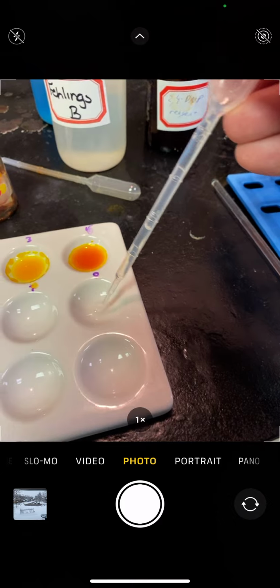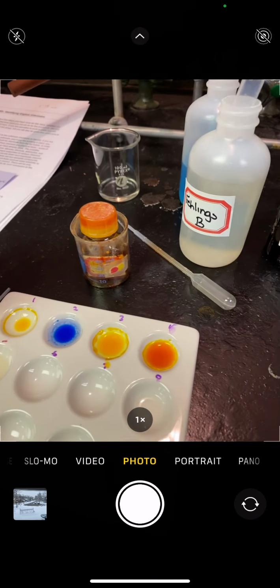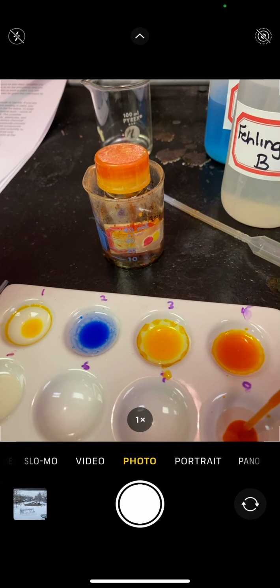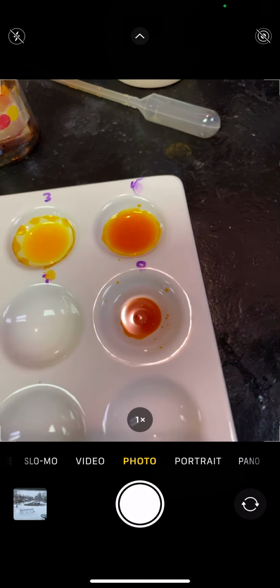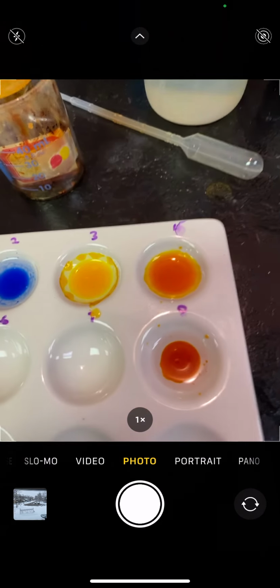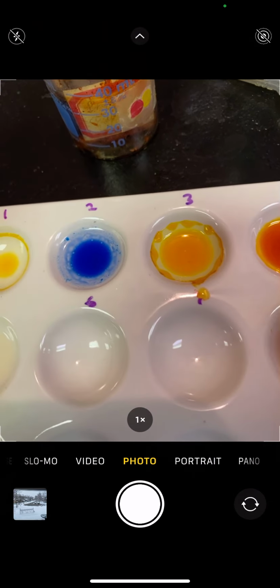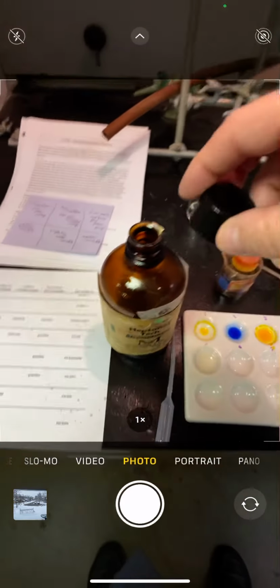So there's the heptanal. See, there's no color in it. All right, make sure I grab the right bottle. Does that say heptanal? Yep. Okay, so now I'm going to add chromic acid to it, see if we get any blue-green. Not working like I would expect it to. Yeah, so this is challenging, to run these with me recording by myself, holding this and doing this lab at the same time.